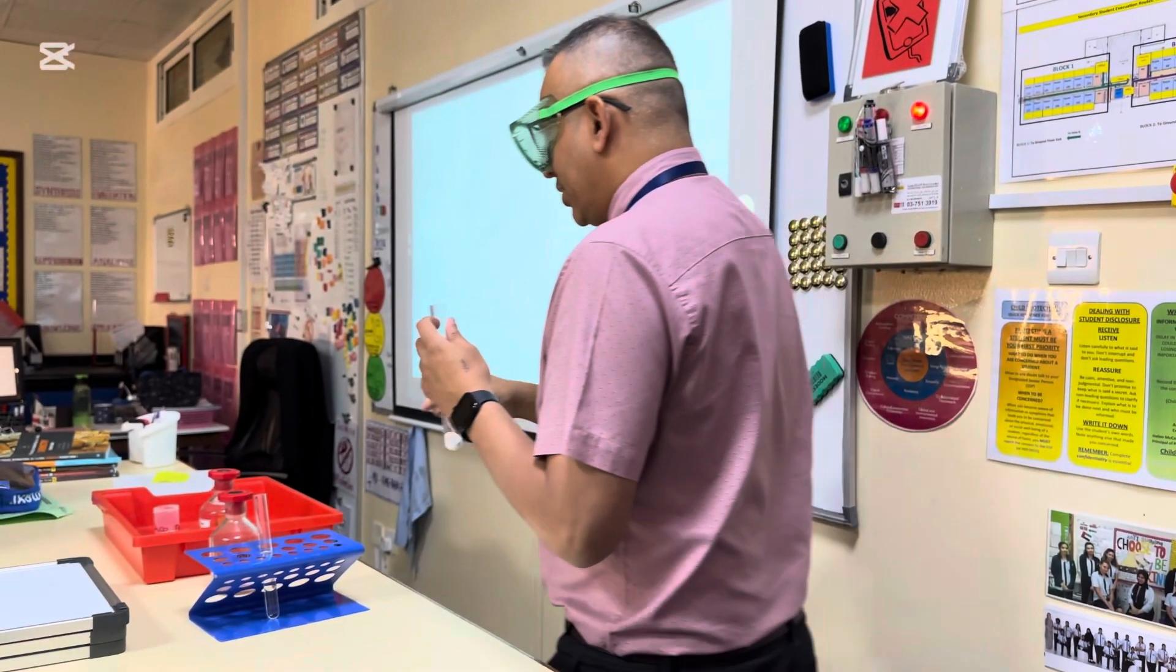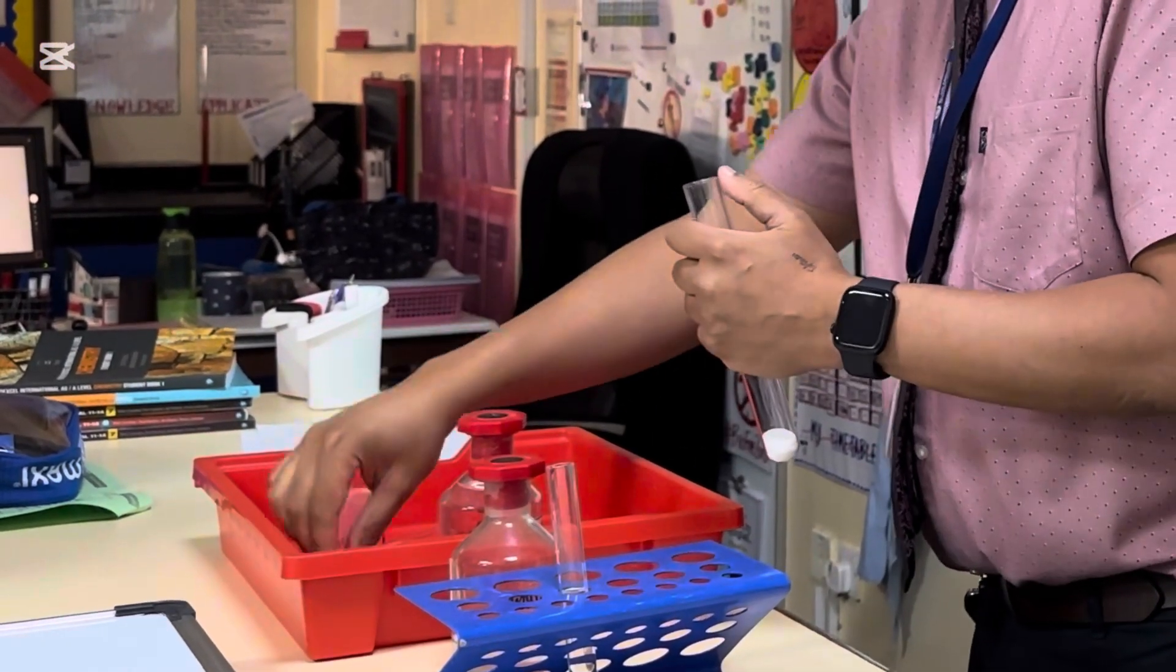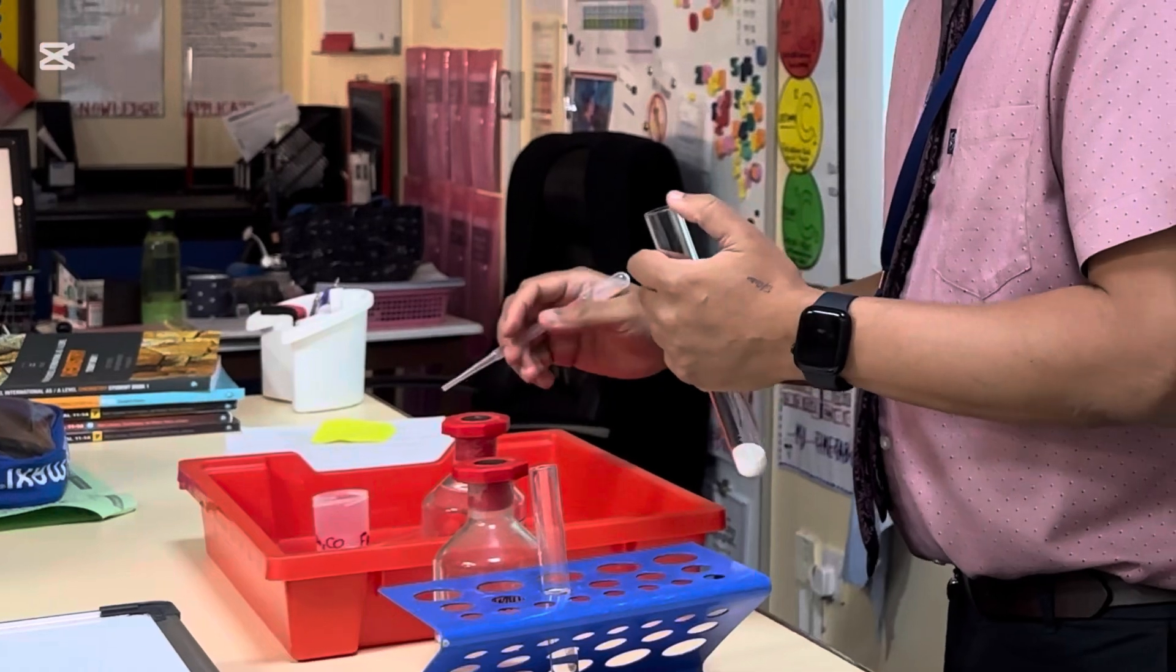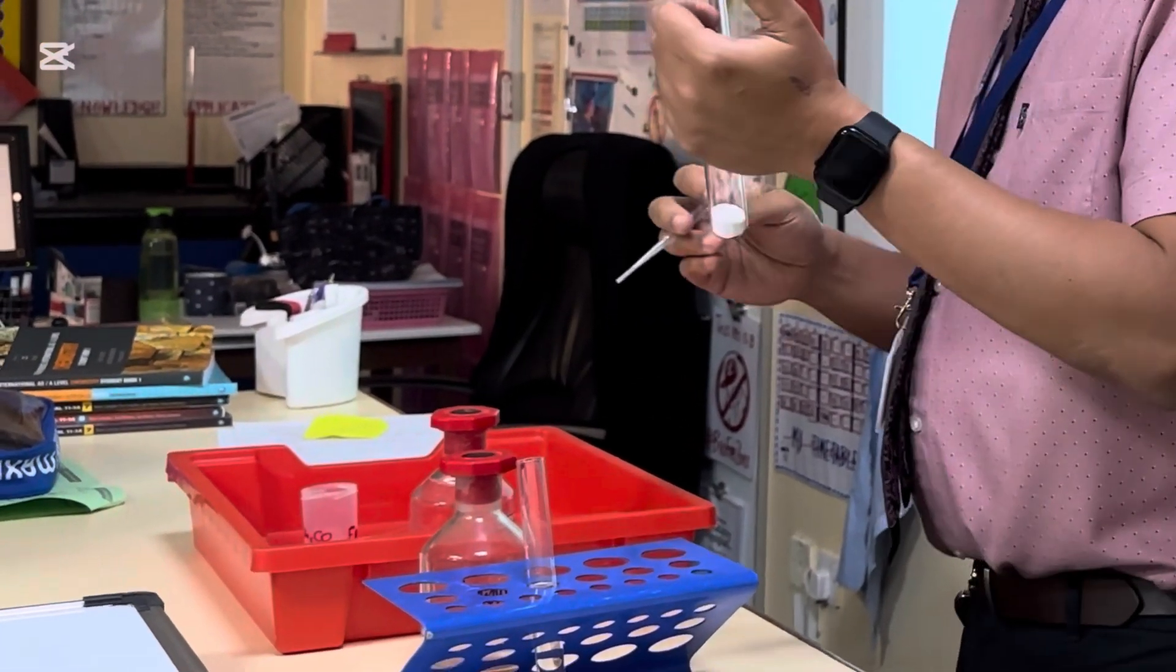And so what I've also got is I've got an acid here. This is actually dilute sulfuric acid. I'm just going to be quite cautious about this. And I'm going to add the acid to the carbonate.